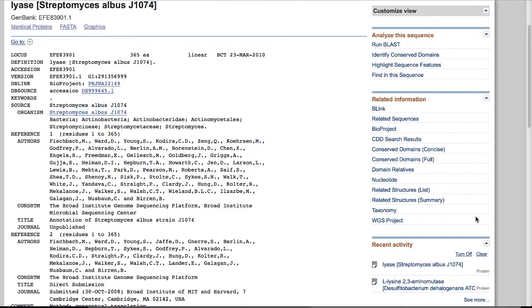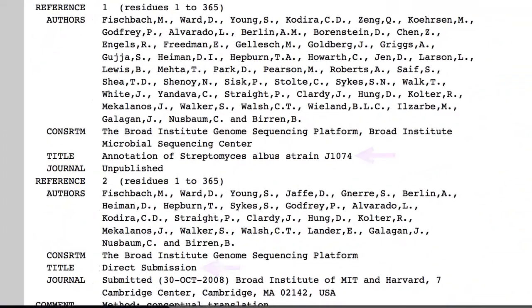Here's an enzyme that's annotated in NCBI's GenBank database simply as a lyase. But if you look at the references, they're all large-scale sequencing papers, so the annotation doesn't seem to be based on experimental data. This sequence is a member of the terpene cyclase-like 2 subgroup of the isoprenoid synthase type 1 superfamily. So we're going to start by looking at a Cytoscape sequence similarity network for that subgroup and seeing how our sequence of interest fits in with the rest of the subgroup.